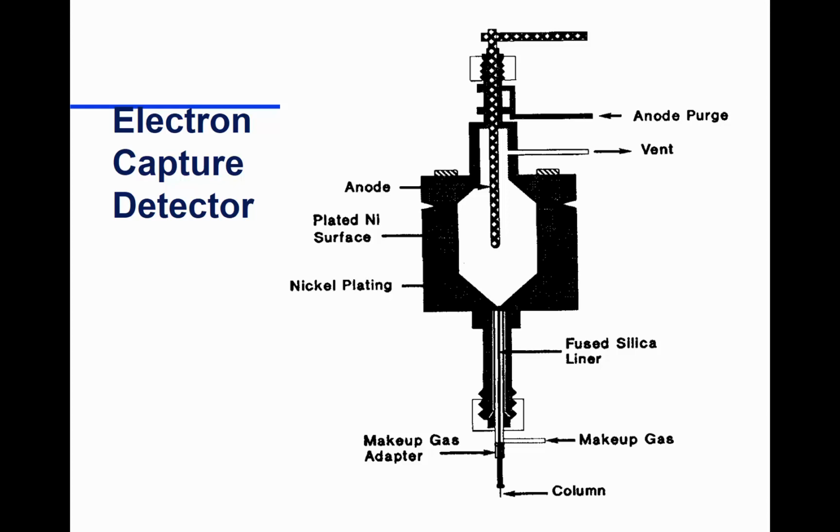Well, we were spending time on gas chromatography, obviously, and we're going through different detectors. Basically, what comes out of the column, how do we detect it? We'd done kind of the workhorse for that, and that was flame ionization. Did kind of the universal detector, which was the thermal conductivity. And then we're getting into more specific detectors. And so this is one of those detectors, which is electron capture.